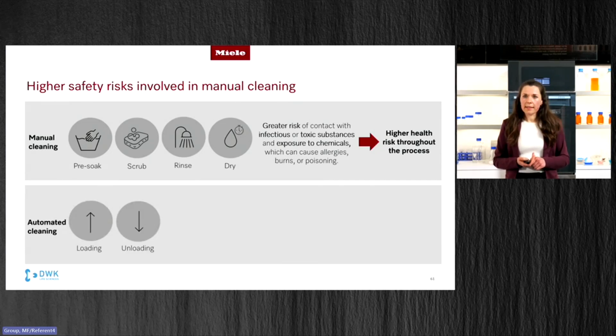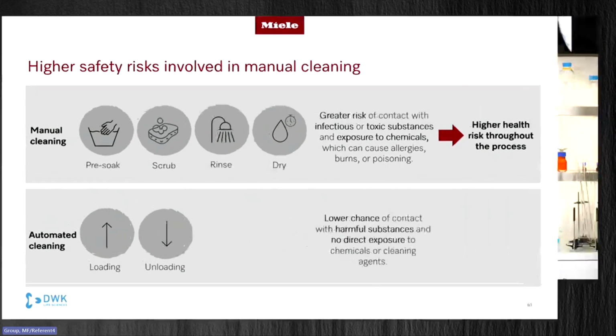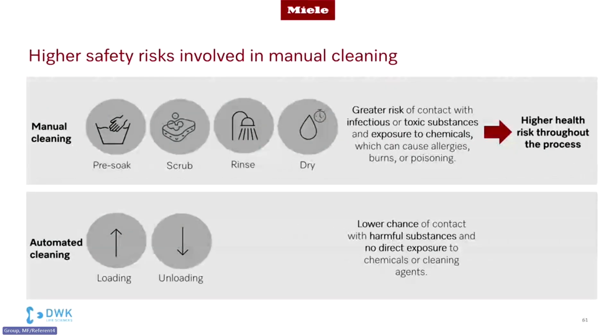In automated cleaning, your role is limited to loading the lab washer and unloading it. So there is a lower chance of coming into contact with harmful substances, and there's no direct contact with chemicals.